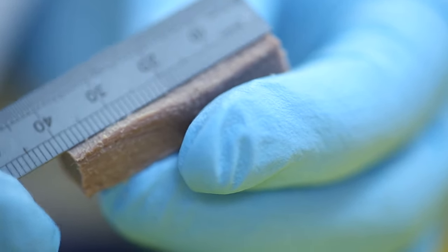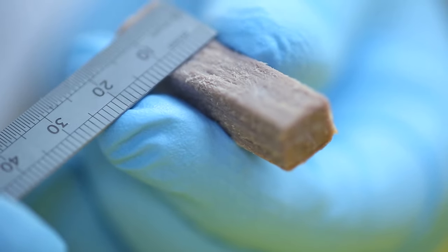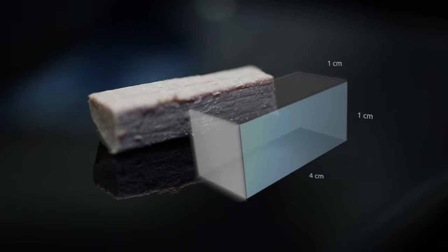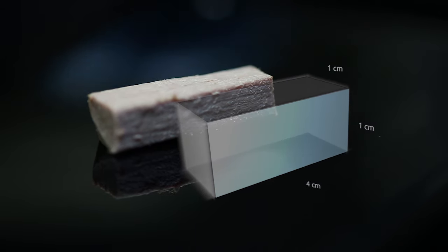In shear force testing, it is important to measure your cores precisely to ensure that they are uniform in size and shape. Cores should be 4 centimetres in length, 1 centimetre in height, and 1 centimetre in width.